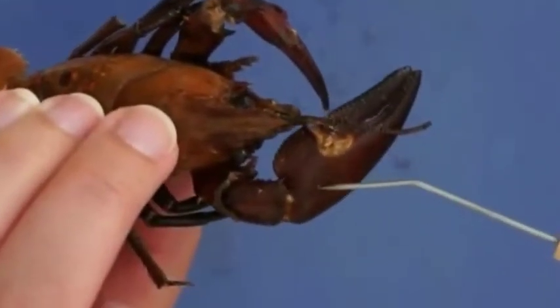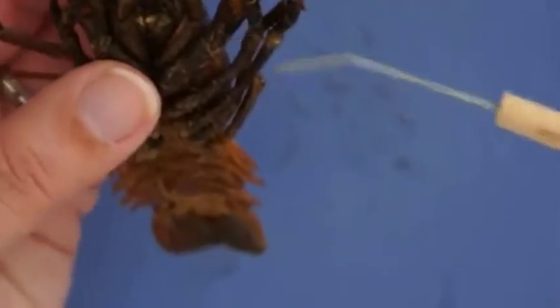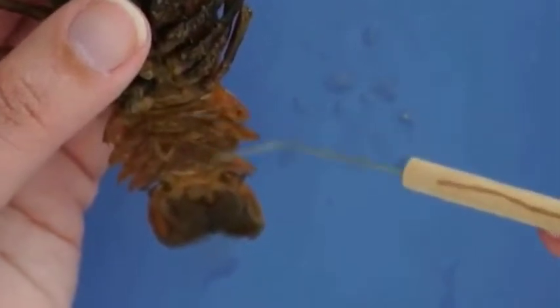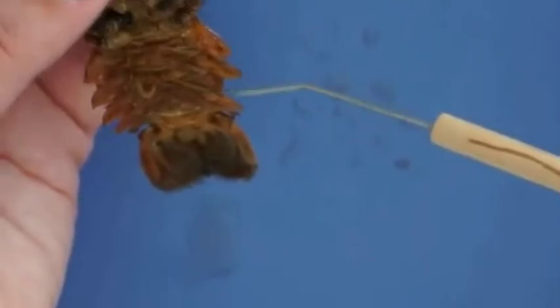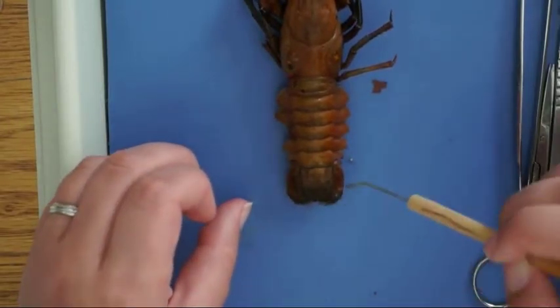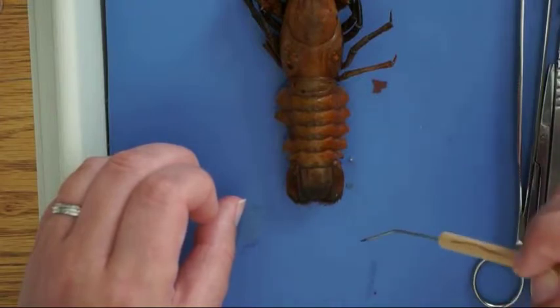And then, of course, there's the chelipeds, which are the claws, and four sets of walking legs and swimmerettes on the abdomen. And then the two sides of the tail are called uropods. They're symmetrical with a telson in the middle.